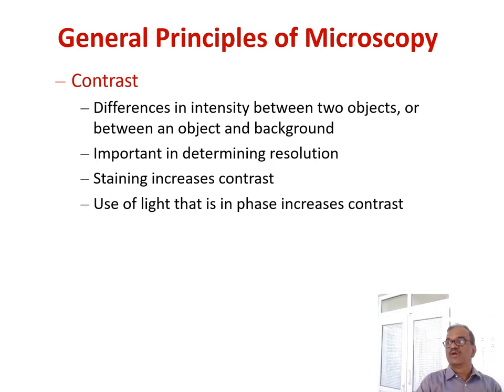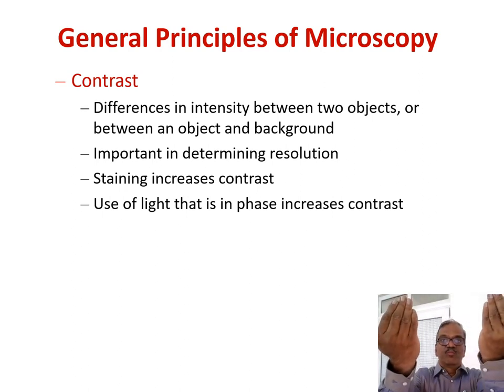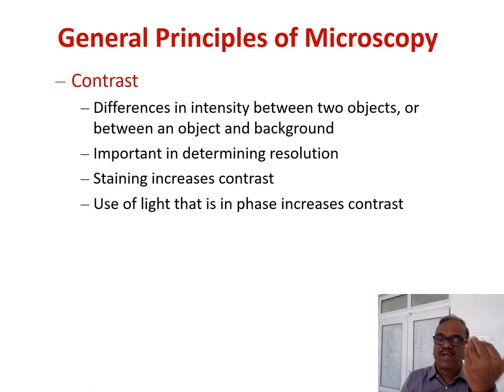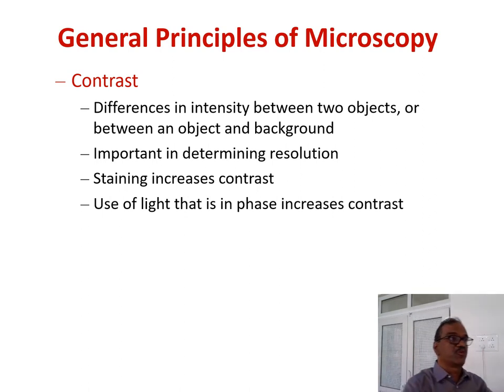Sometimes you will use PowerPoint slides that are merged with one another. Even I can't read from here. This is a white background with black letters, and easily everybody can see. But if you make some other background, a light bluish background with black color, it's not possible to observe, isn't it? Same thing, contrast is important. Use of light that is in phase increases the contrast. The light is moving in different phases, so one is easily made thick and another thinner or a different planar surface, so you can observe different thickness. This is used for studying living cells: the phase contrast microscope.